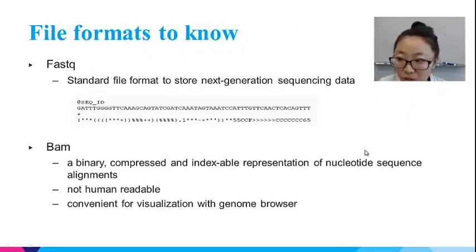As we know, sequencing data are very large, therefore it's stored in specific formats. The most frequently used format is FASTQ. For each short read, 4 lines of information are written in the FASTQ file. The first line starts with the @ symbol and is the sequence ID. It's usually generated by the machine. The second line contains the sequence of the short read in ACTG codes.